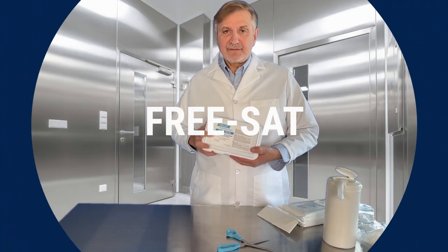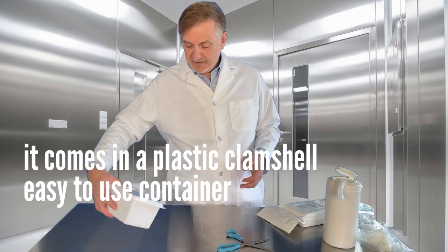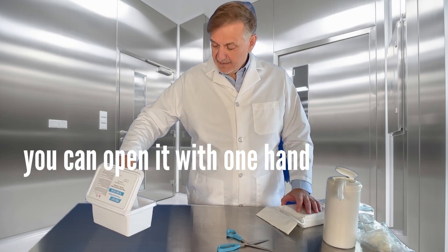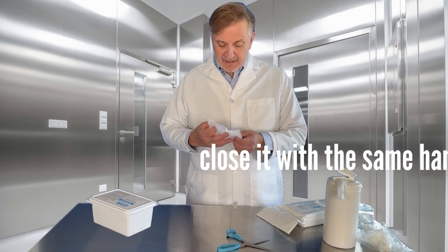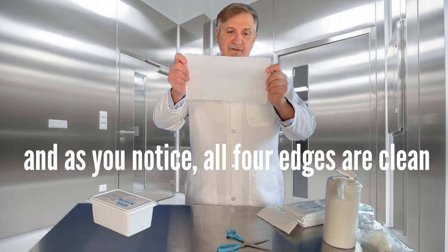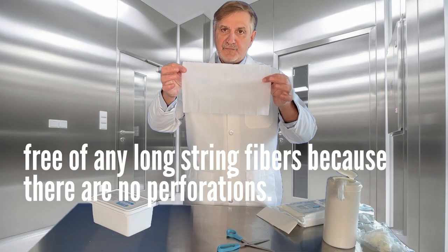High Tech Conversions has FreeSat. It comes in a plastic clamshell, easy-to-use container. You can open it with one hand, take out one wipe with one hand, and close it with that same one hand. As you notice, all four edges are clean, free of any long stringy fibers, because there are no perforations.